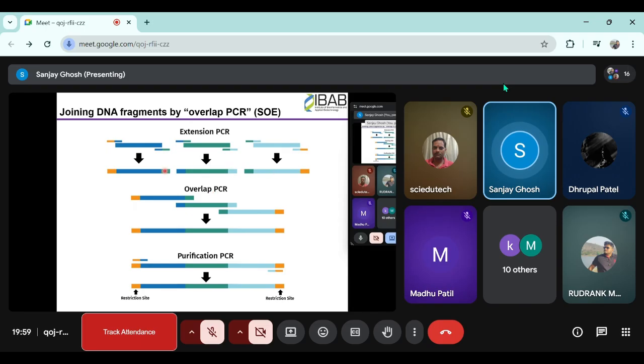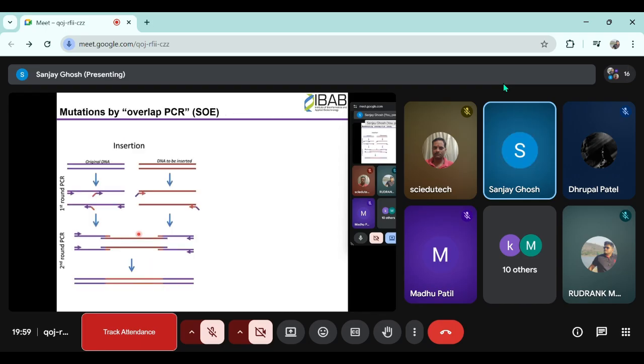Then you mix these 3 independent PCR products into one tube, you get one long thing, and this you can purify or you can ligate by doing this joining of yellow and yellow, right? So this is how you can basically join multiple fragments without restriction enzyme, without any ligase, just based on PCR and primer design. So this is the last step maybe for today. I mean, I want to describe.